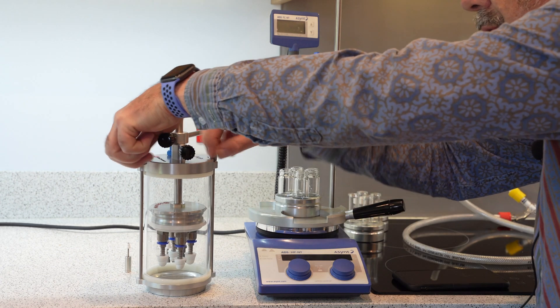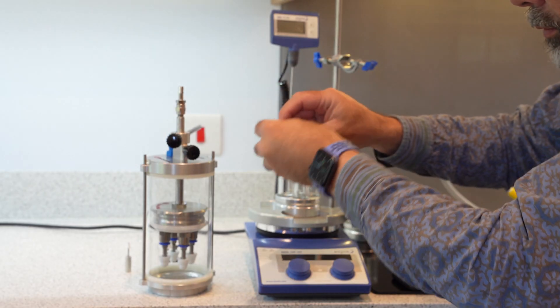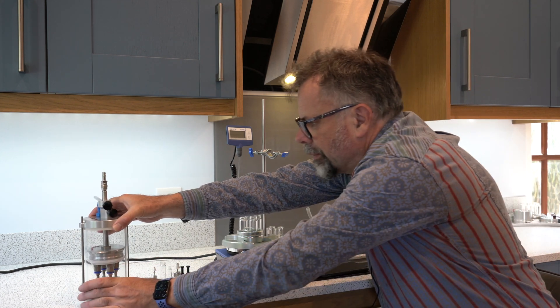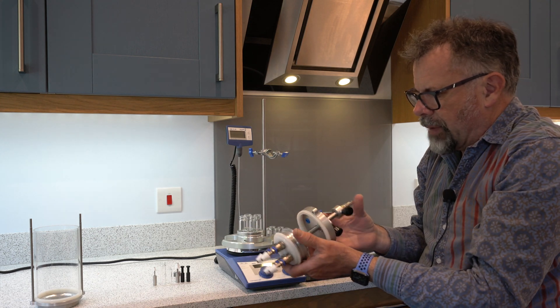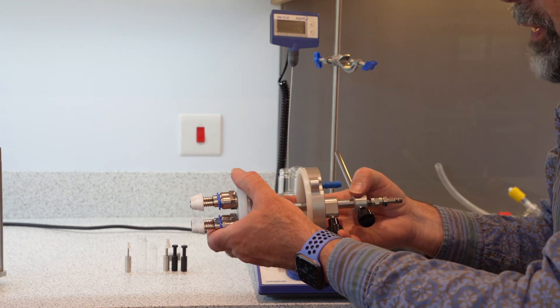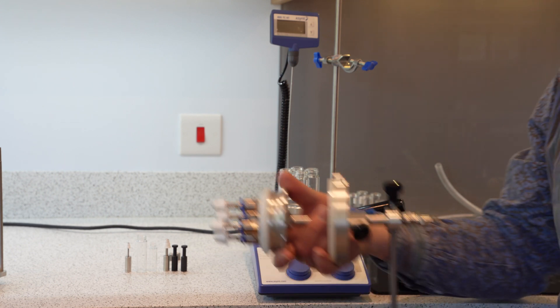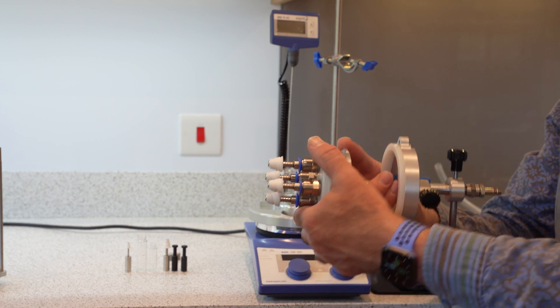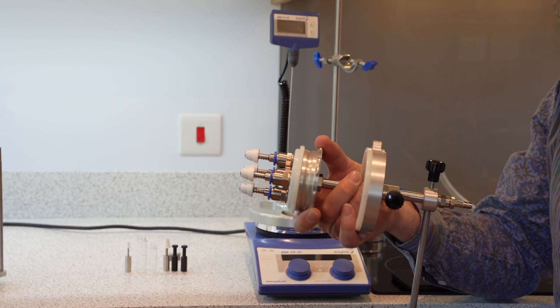I'm going to undo these two thumb screws, put those down safely, and then the unit can easily be lifted out. Now I have access to the head assembly — if you were to have any potential contamination from overfilling tubes, this can be unscrewed and easily cleaned out, so that's not an issue for contamination.